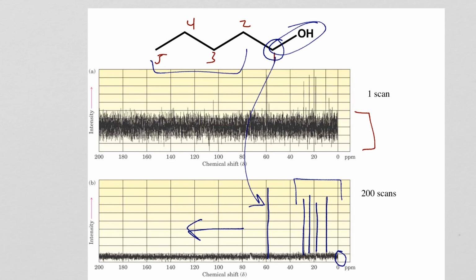So that just gives you a little sense of what a C13 NMR is going to look like, and hopefully a brief overview that is useful of the theory and practice behind NMR.